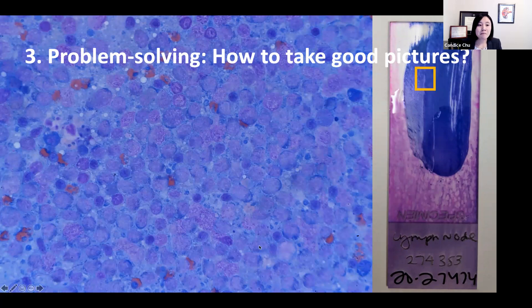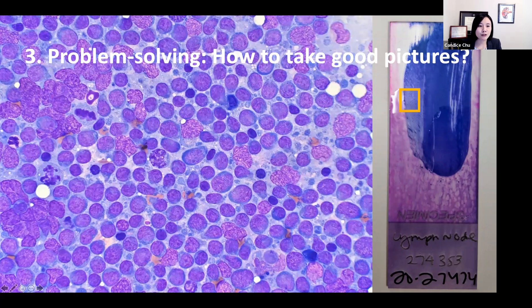So you need to go to a better location like here. Right now things are looking better, but still pretty crowded. So for a slide as thick as this one, the optimal location will actually be at the periphery. This is where you can get the best picture out of cytology.